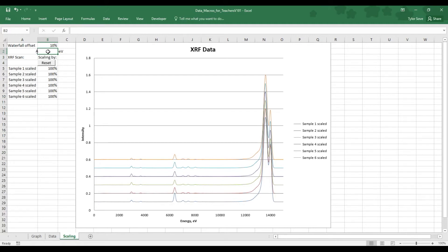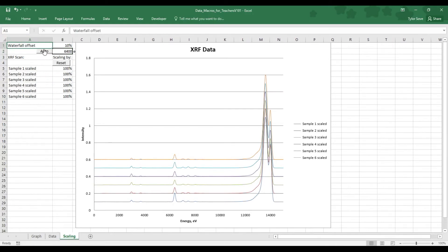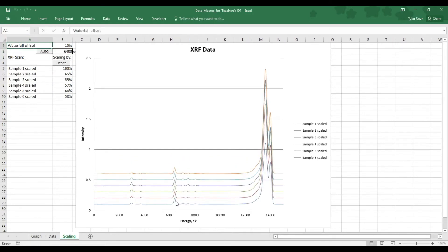So, for instance, if you knew that there was a certain amount of iron in each of your samples, and it was the same for each, you can go ahead and enter the iron energy here, which is 6400, and then you'll need to open this up a little further, but you'll select this auto button, and that will scale all of these spectrums so that the iron peak is the same for each.